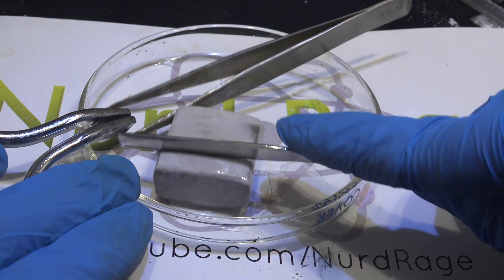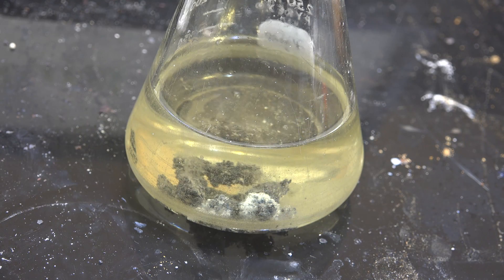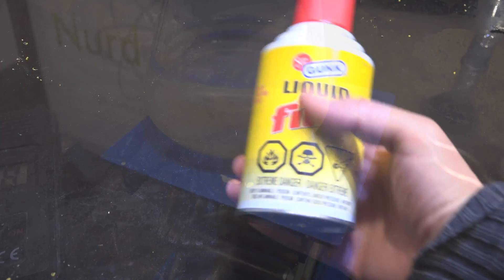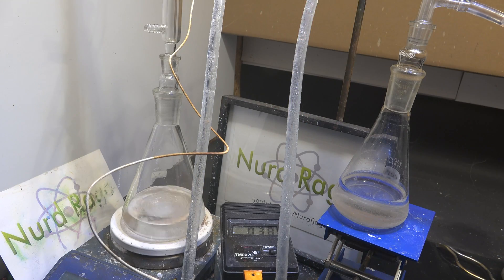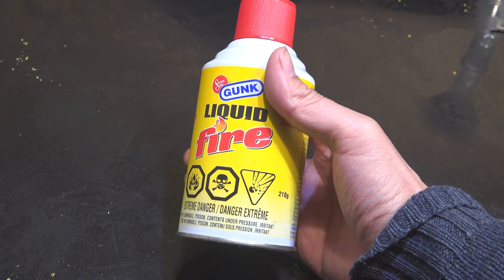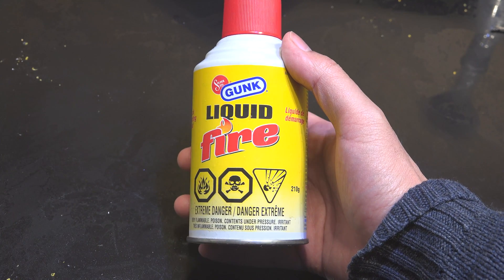Alternatively you can store diethyl ether over sodium hydroxide or sodium metal. You can even use the sodium magnesium oxide aggregate I showed how to make in a previous video. To be honest though, don't even bother storing your ether separately — instead keep the original can and only distill it out when you want to use it. Distilling it out and not using it is unnecessary. In the can it's protected from light and more importantly there's no air, only carbon dioxide propellant. So it can last many years without peroxide formation.